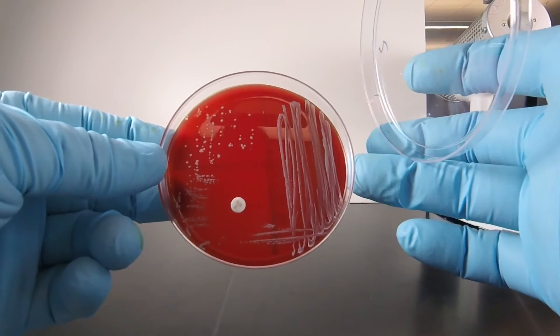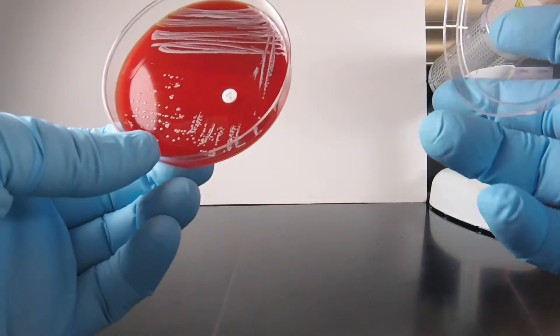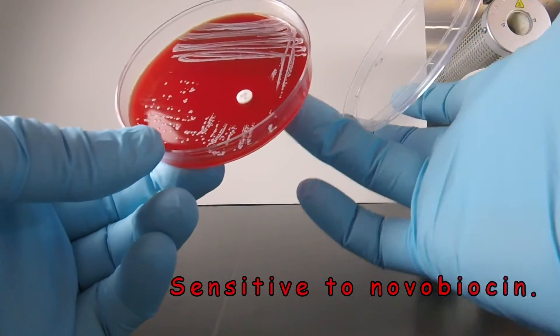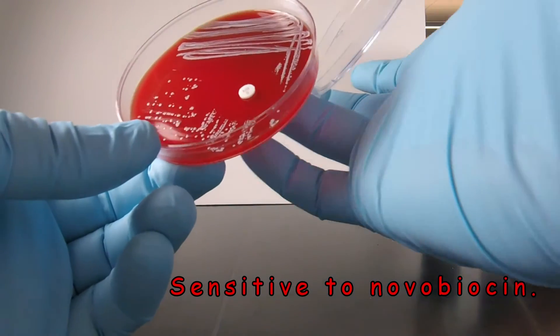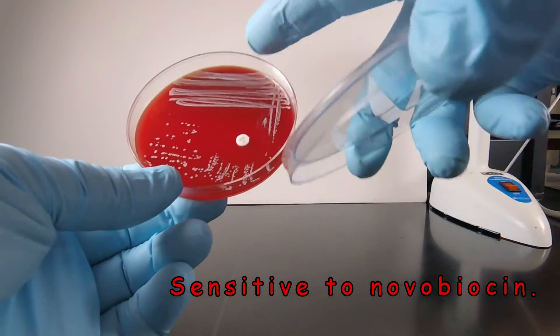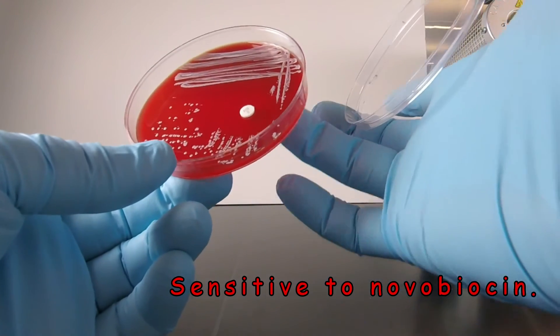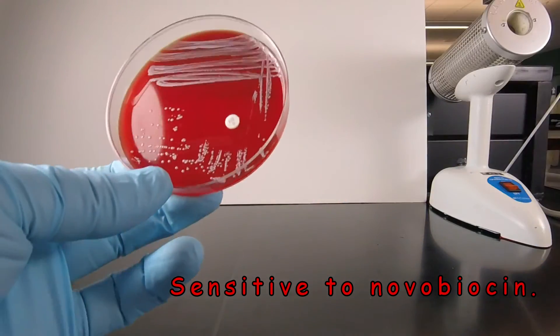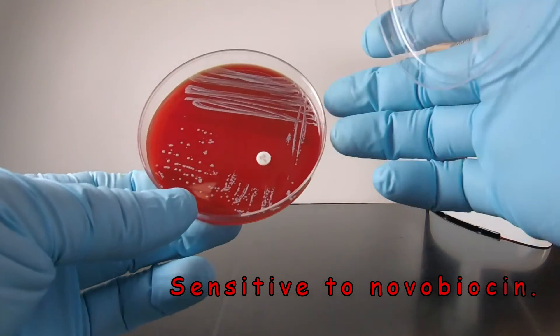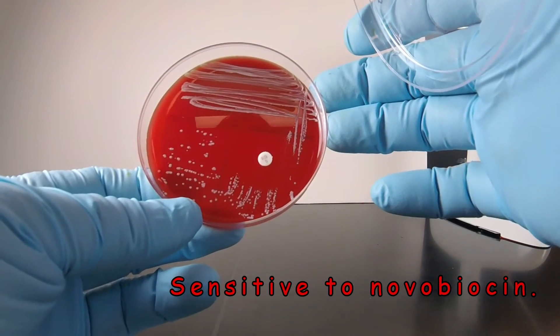We also notice there's no pigment being produced. The colonies are white, and we see around the novobiocin disc a large zone of inhibition where the bacteria are not growing near the disc. The bacteria were streaked over this section, but again we see there's no bacteria growing in a large circle around the disc.